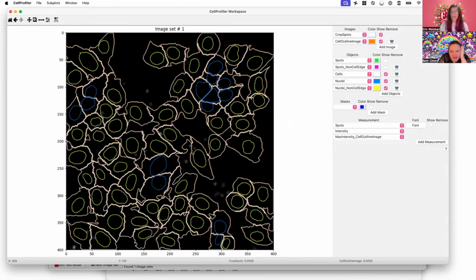Oh, this is great. Because definitely sometimes our boundaries aren't perfect, and being able to sort of sanity check ourselves and only give ourselves objects we're super confident in is awesome. Yeah, absolutely. Well, thanks for joining me.